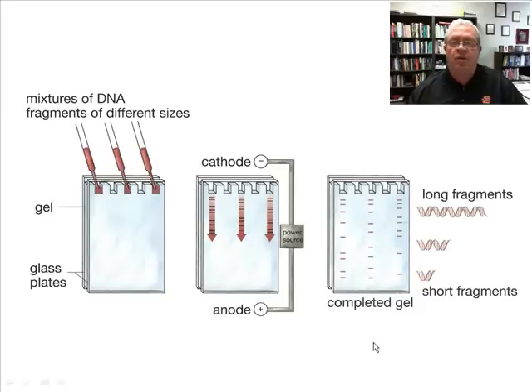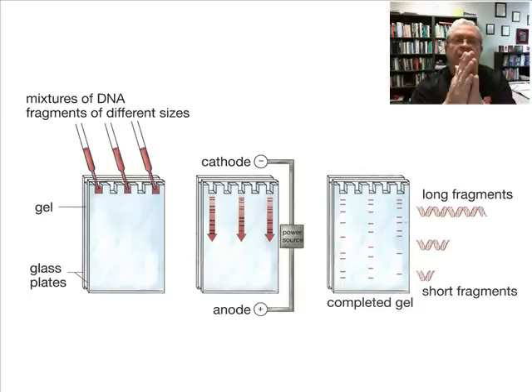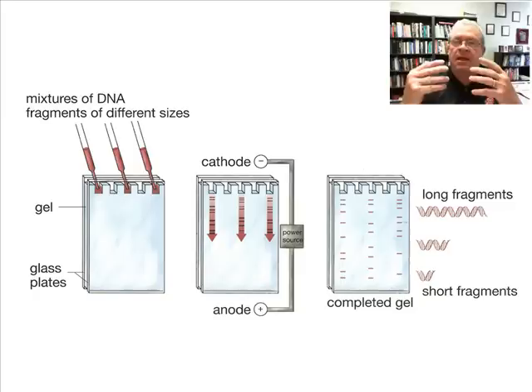And so, what is a DNA profile? They've been called DNA fingerprints. Kind of like fingerprints, they identify people. Same thing with DNA fingerprints, so to speak, or a DNA profile. A DNA fingerprint or profile is simply a pattern of lines on a gel.